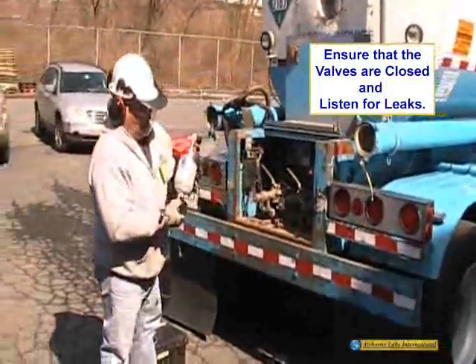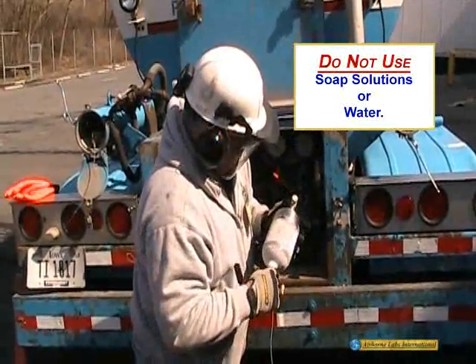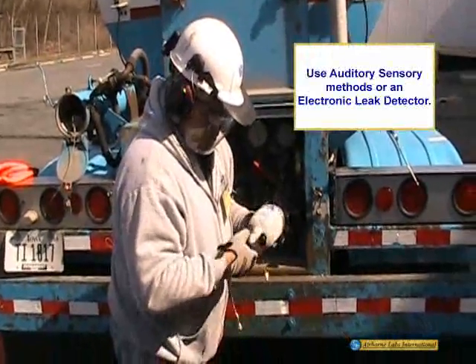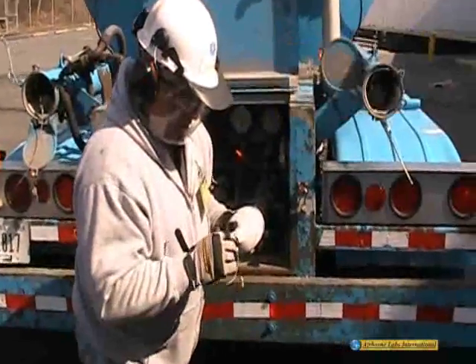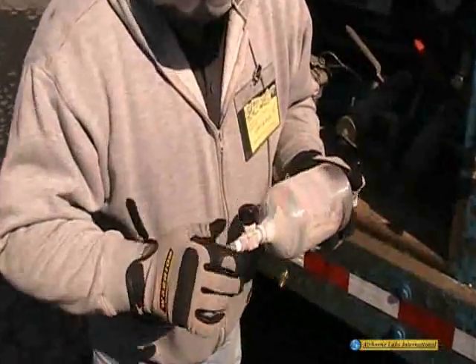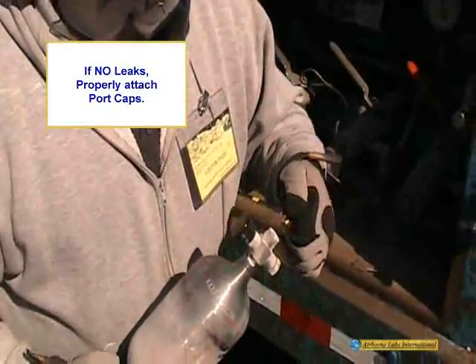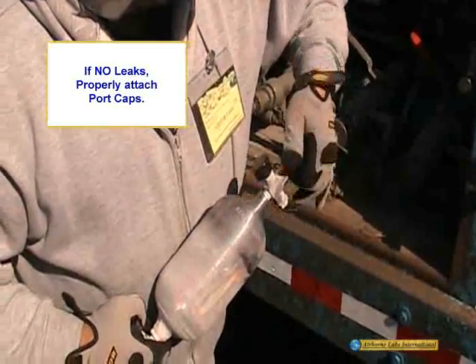Listen for any valve leaks from the cylinder. Do not use any soap bubble leak detection agents or immerse the cylinder in water. Use only audio sensory methods or an electronic leak detector. Do not ship any leaking cylinder. If no leaks are detected, properly attach all lanyard-secured port caps and ensure that all needed sample ID information is entered onto the sample ID tag and analysis request form.